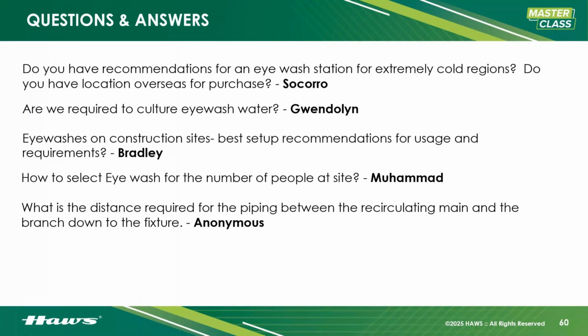And of course, you're going to tee off to that and you're going to bring that down to the endpoint, to the fixture. That distance you want as short as possible, right? If we have a continuous loop of water, say we're even heating that, right? We have 85-degree water on a loop in the facility, constantly available and ready, being supplied by a tempering skid, for instance, maybe one of our tempering skids. That's awesome. That's like the best setup.